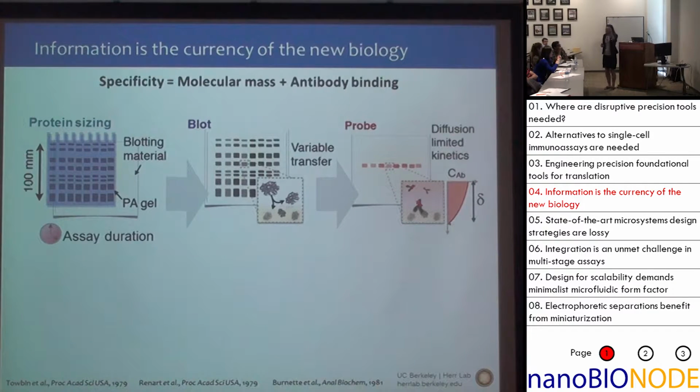And then I think one of the biggest concerns is the assay itself requires a tremendous amount of starting sample mass. There is no way you can do this assay on a single cell as implemented here. And of course, many of you probably realize that in diseases like cancer, cell-to-cell variability is where it's at, right? That's the information we need to know to help fill in the blanks and how that disease is going to progress or respond to treatment.